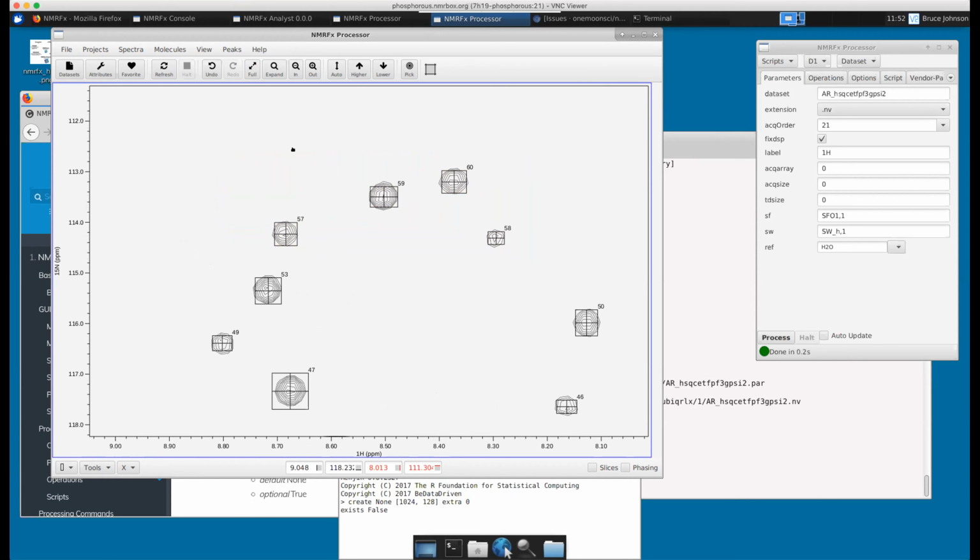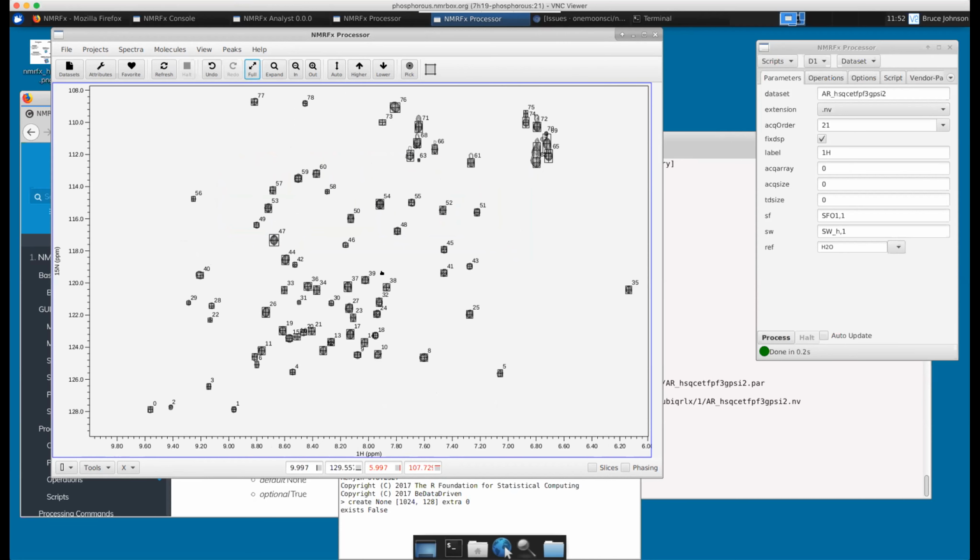For both the resizing, as you start dragging, the border is a dashed line. If you let go while it's still dashed lines, nothing happens. So if you accidentally start dragging and decide you don't want to do it, just move back until it's dashed lines. We can do a variety of interactive changes of peak positions. I showed you that.